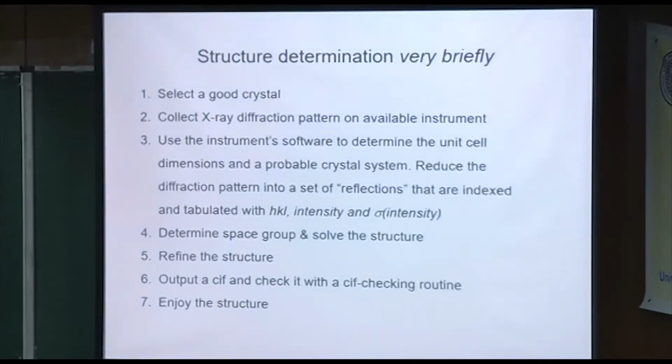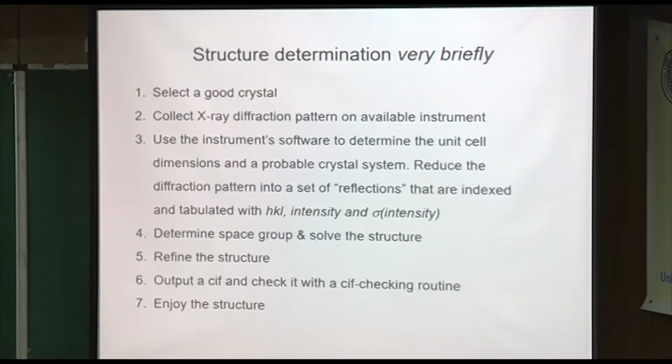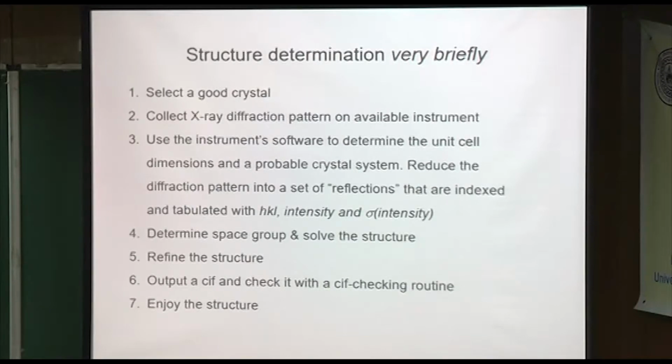No, two more. Okay. So pretty soon we're going to actually go through the whole shebang of doing the structure determination. I want to talk about selecting a good crystal, even though you may not be the person who finally selects the crystal, but I want to talk about that somewhat. Anyway, you can put them under the microscope probably and see if you have a good batch.